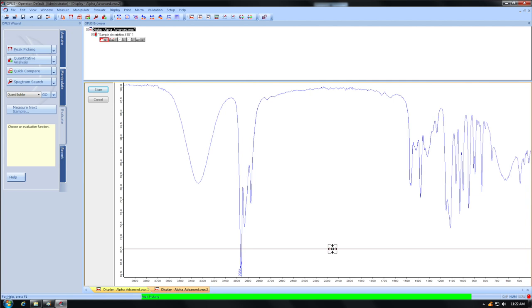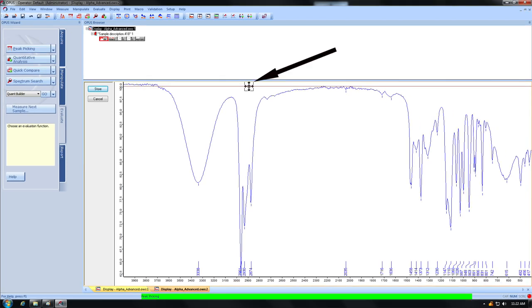In order for it to work, right click somewhere on the spectrum and left click on the cursor so you can change the threshold.